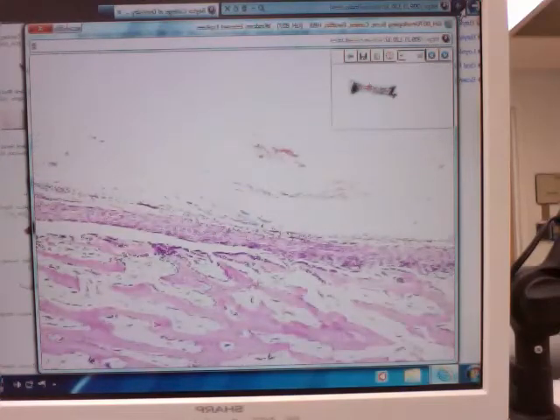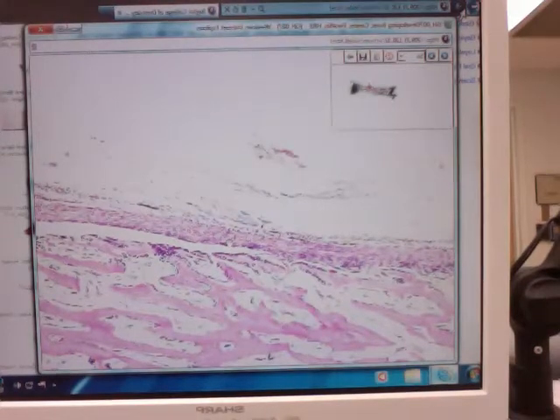What cells are getting rid of the cartilage? Question is, what cells are getting rid of the cartilage? It would be a clastic cell of some sort, and you'll see some people say that they're osteoclasts. It's really nothing you have to know, so I wouldn't worry about it. But if you're eating cartilage, basically you're a chondroclast. Okay.